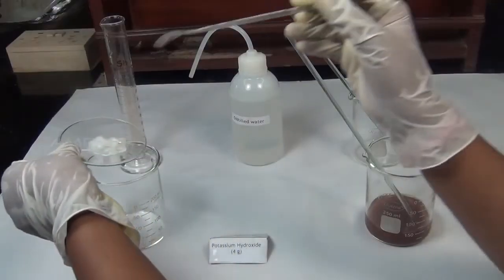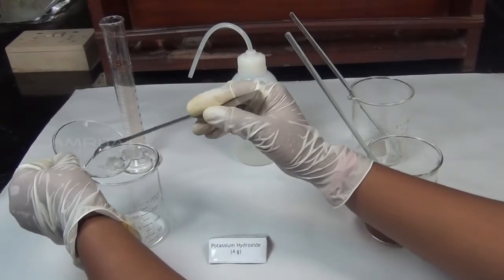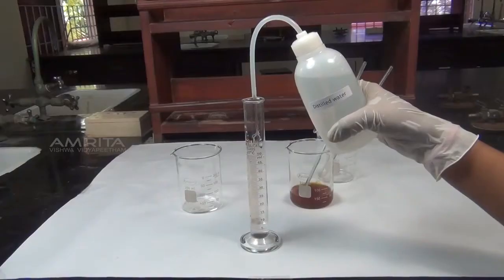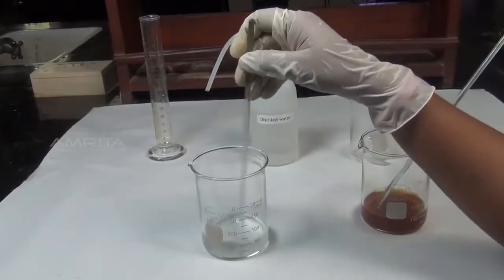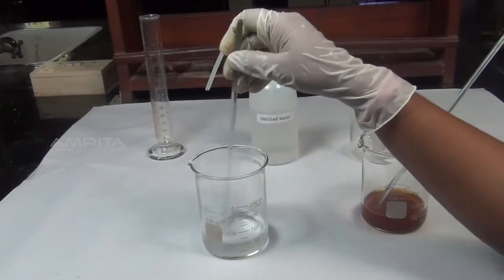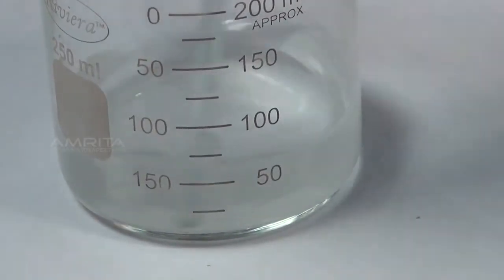In another beaker, take 4 g of potassium hydroxide. Pour another 50 ml of distilled water into this beaker. Stir the solution using a glass rod to dissolve potassium hydroxide.